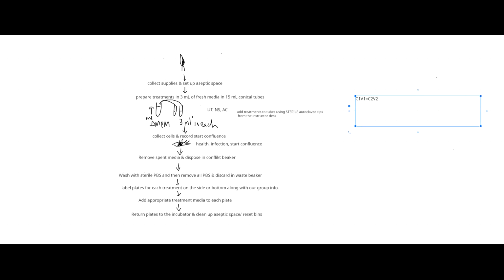Most of our drugs are reconstituted in alcohol, which evaporates out. So your final volume pretty much remains that 3 ml. Okay? You good, Blue? So that's basically the gist of how you're calculating that concentration. Go ahead and calculate it since you didn't do it the first time.